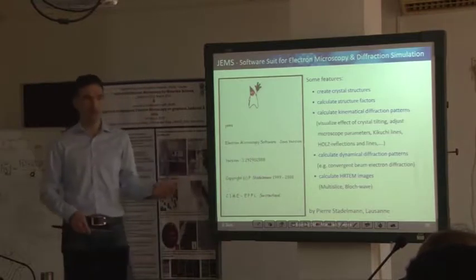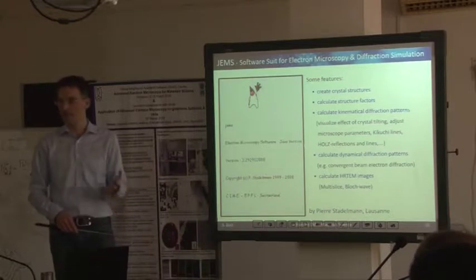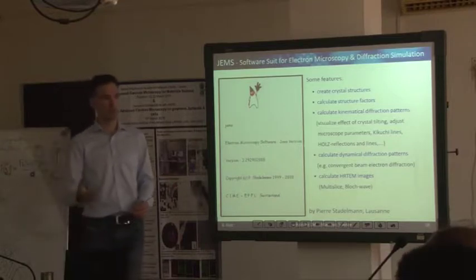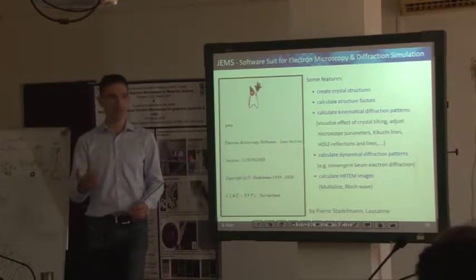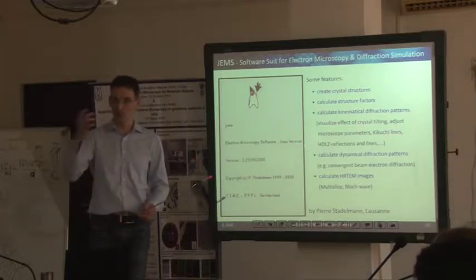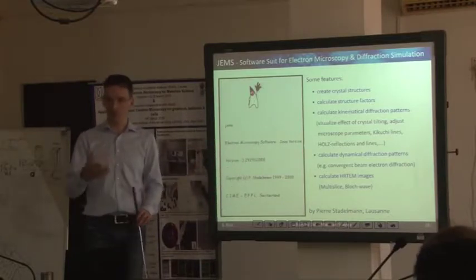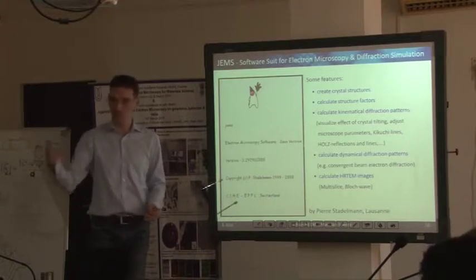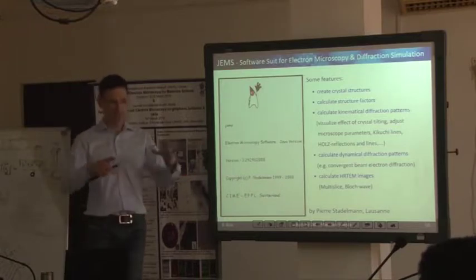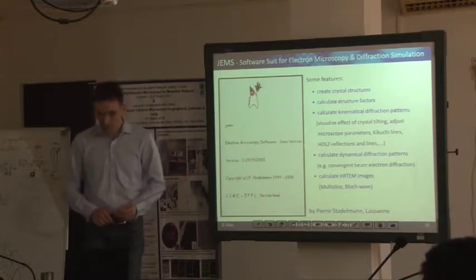You can do atomistic simulations like high-resolution TEM calculations, high-resolution STEM calculations, and all that with one software package. And you can use almost any kind of crystal structure, so you can build crystal structures and import all those files. Some of these numerical approaches to diffraction patterns just rely on a certain distribution of scatterers in space, so you might be able to use extended crystals like a nanoparticle to calculate diffraction patterns, for instance.